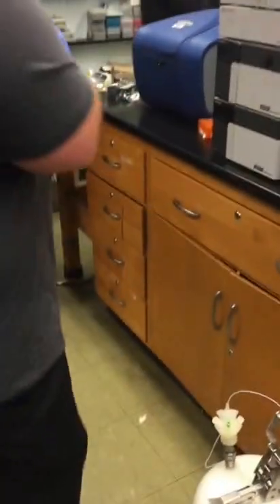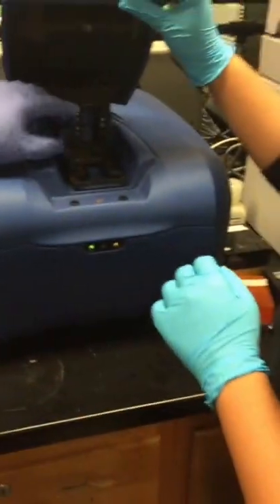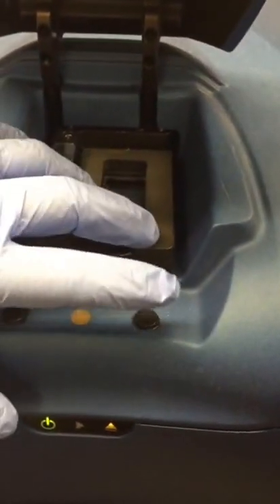Go ahead and put it in, Bruce — you know how to do it. We're just going to put it in. The word 'Agilent' on this particular chip is facing down. And I'm going to close it.